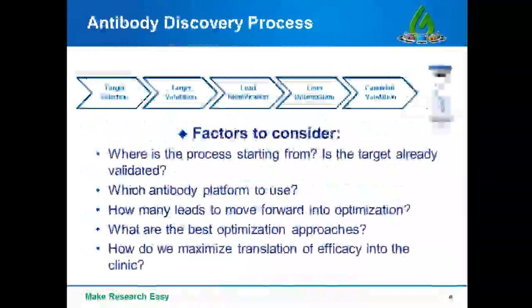The question of which antibody platform to move forward with is often a dilemma. The hybridoma-based approach is the most mature way to generate monoclonal antibodies. It is relatively inexpensive and easy to produce in small quantity. Human anti-mouse immune response is a substantial problem for therapeutic antibody purposes, so antibody humanization is a must-do before it can move further.